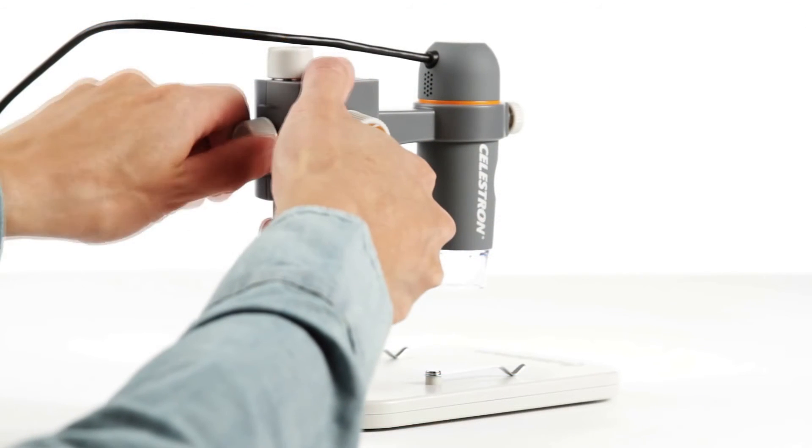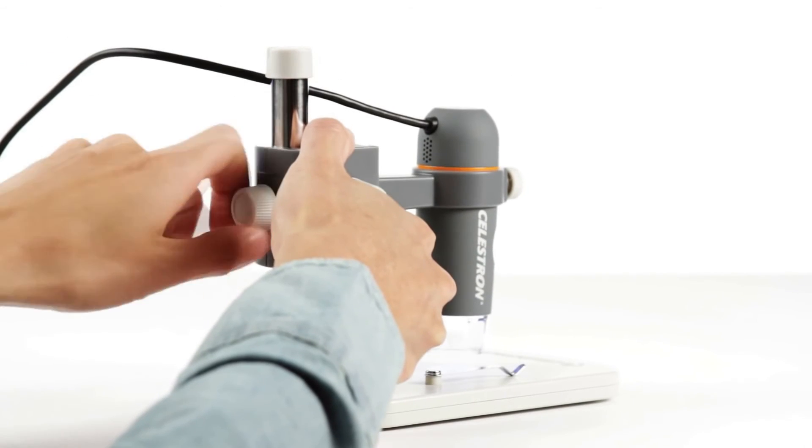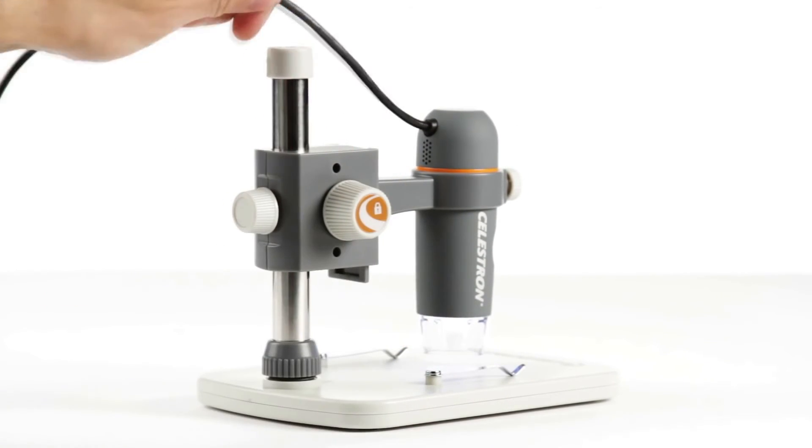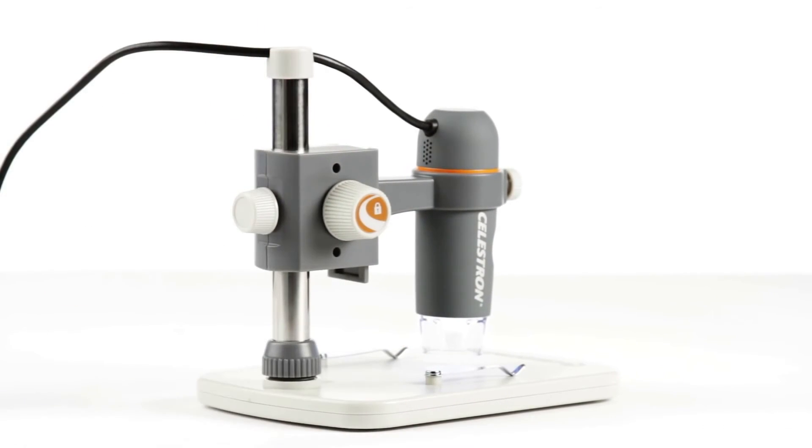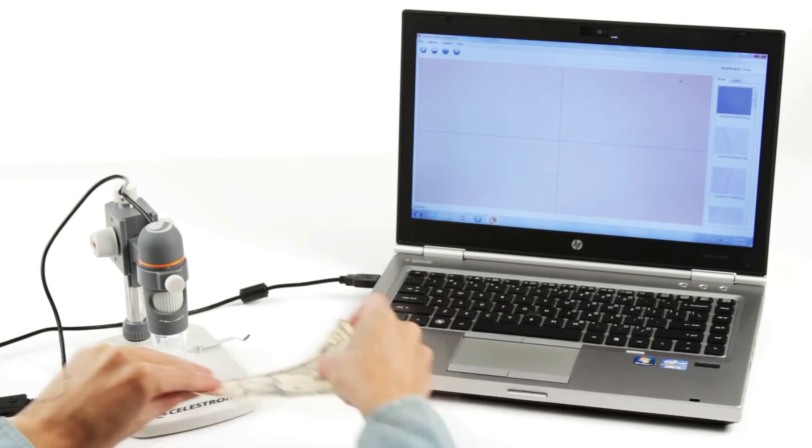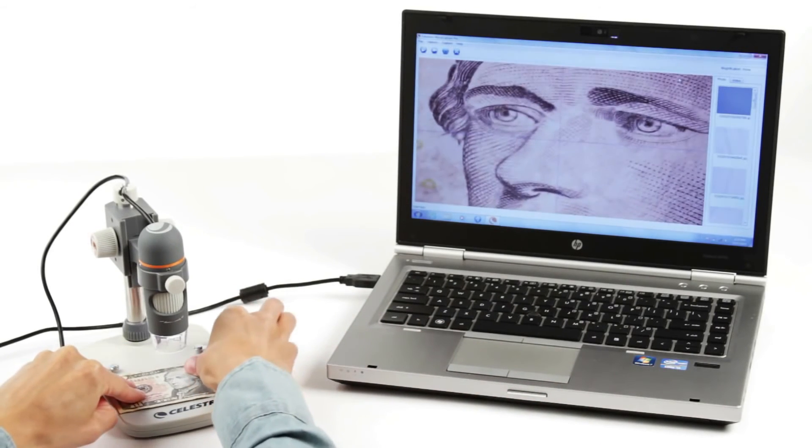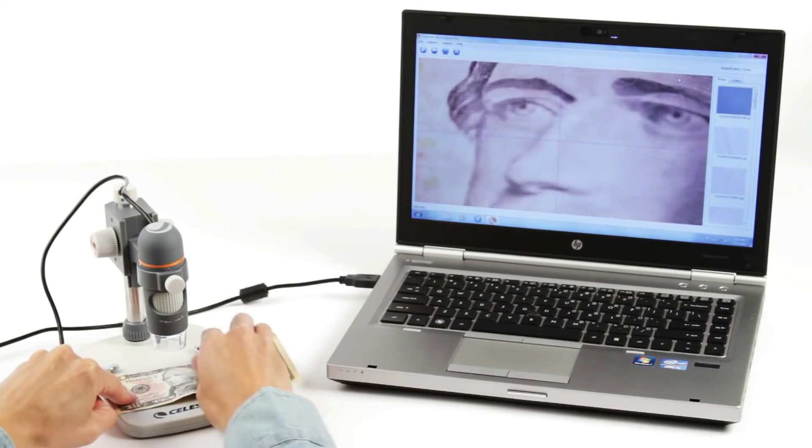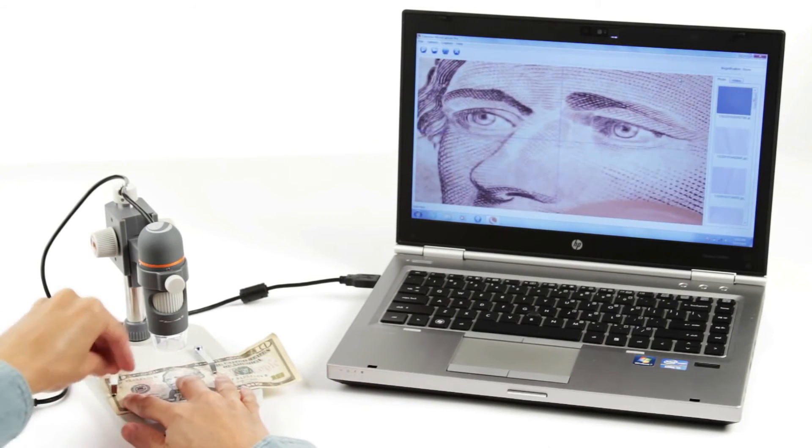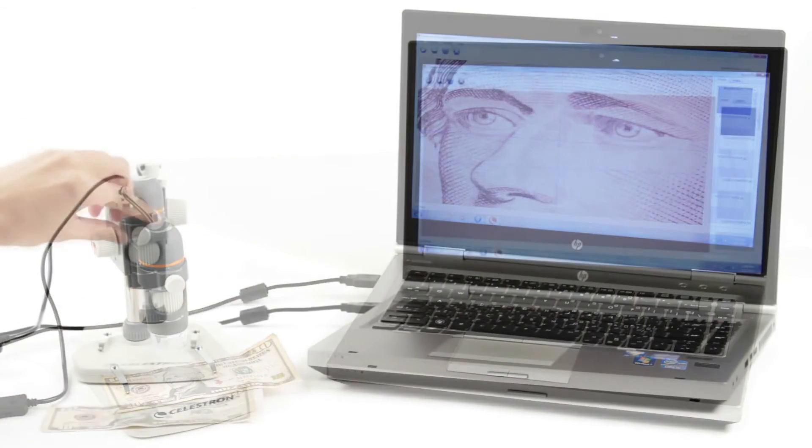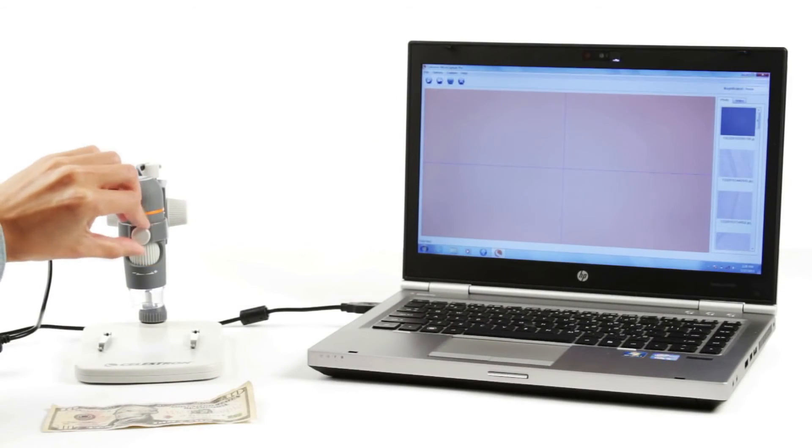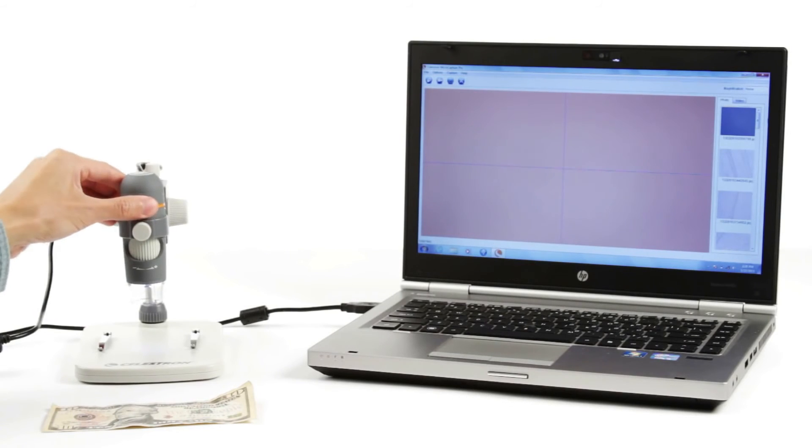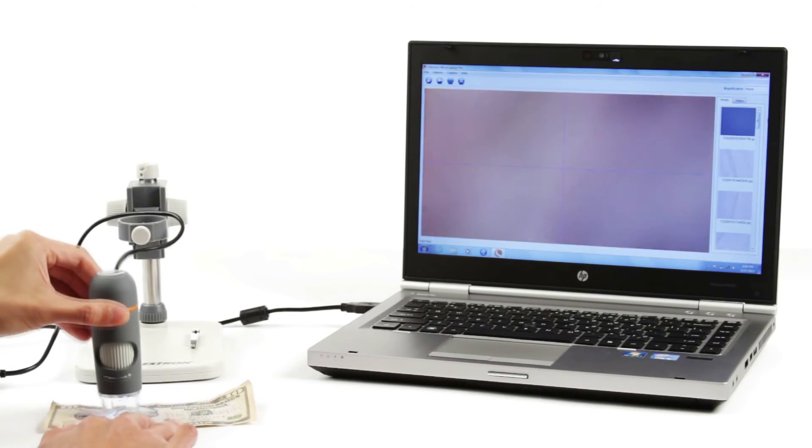Another great feature only available with the handheld digital microscope Pro is the easily adjustable sturdy stand. The stand stage provides the perfect platform for your specimens and includes metal clips for anchoring flat objects like paper documents and stamps. The microscope smoothly detaches from the stand so you can use it in handheld mode for closer views of your specimens.